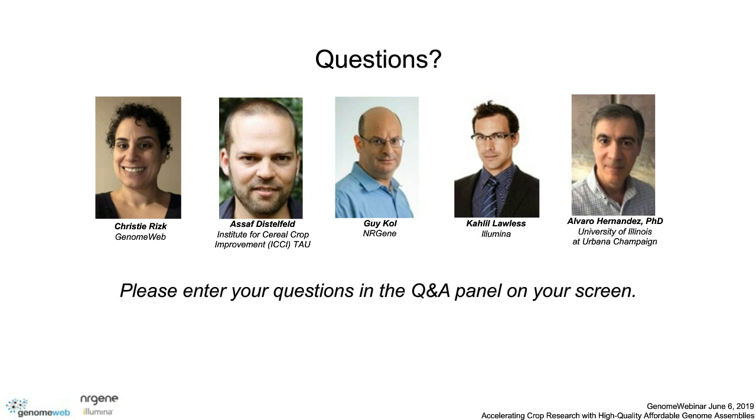All right. Could anyone comment on how compatible short reads are to long reads using Oxford Nanopore technology? Alvaro, maybe you want to take that one? Yes, so we mostly use Oxford Nanopore for small genomes, so for bacterial genomes, for yeast, for fungi, and some eukaryotic small genomes like in insects. Oxford Nanopore is an evolving technology. Every 2 or 3 months they come up with new base callers, with new flow cells, with new capabilities that are decreasing the error rate, let's say increasing the accuracy. For small genomes, we see it working well.